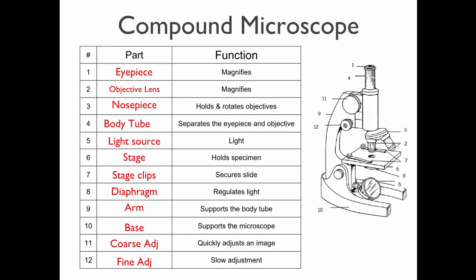The dissecting microscope just has one focusing knob, that's this, and it moves this up and down. The other thing it has is this knob, which you can move the whole apparatus up and down. Usually you want it about halfway.